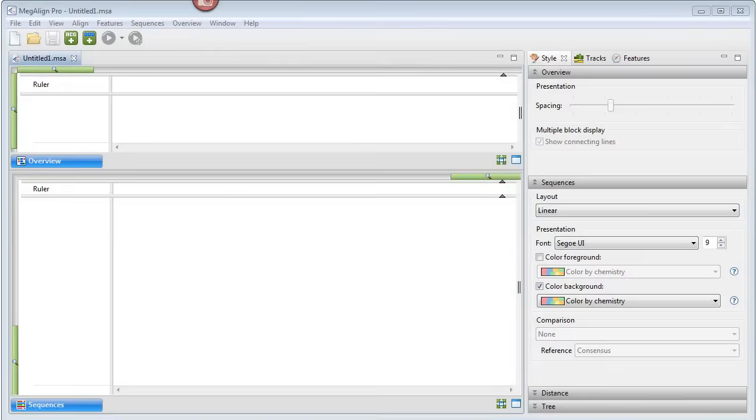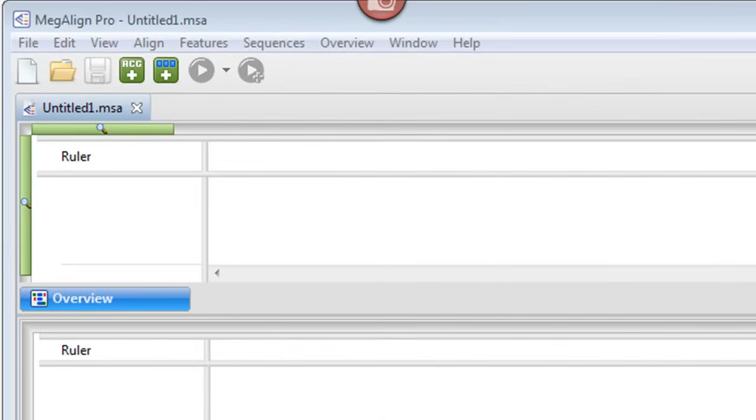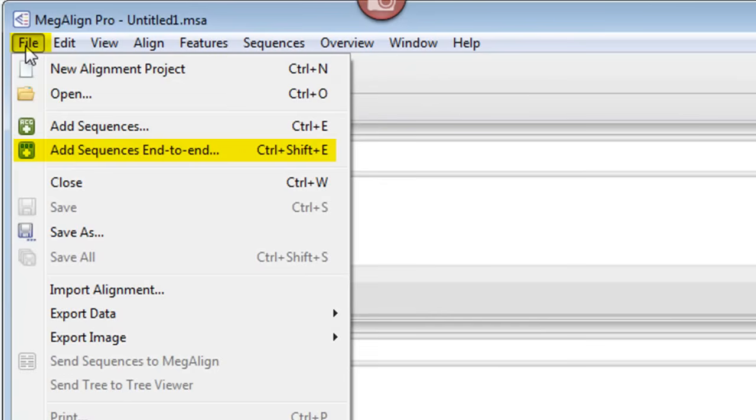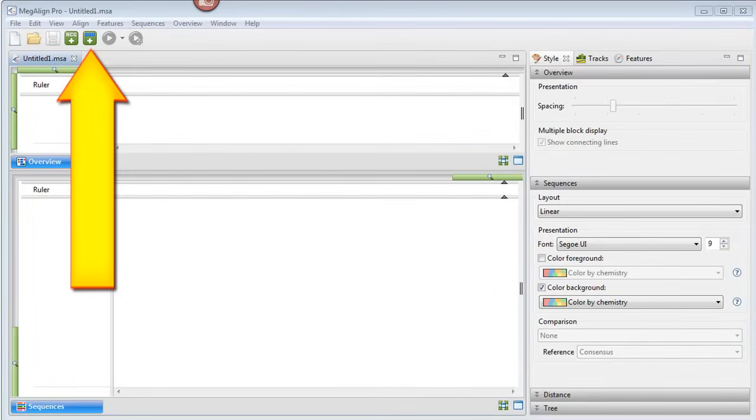We'll begin with an empty new project. To add our sequences, we can either choose File, Add Sequences End-to-End, or click on the Add Sequences End-to-End in Project tool.